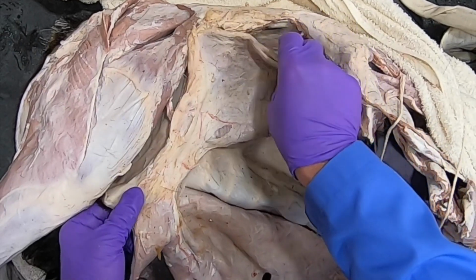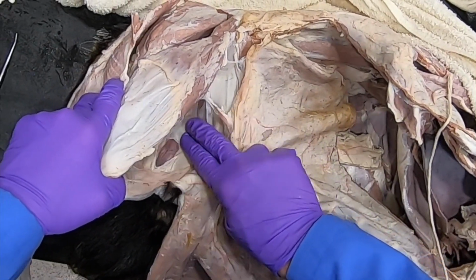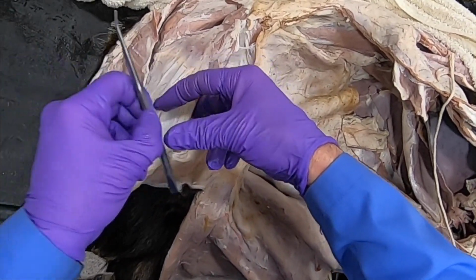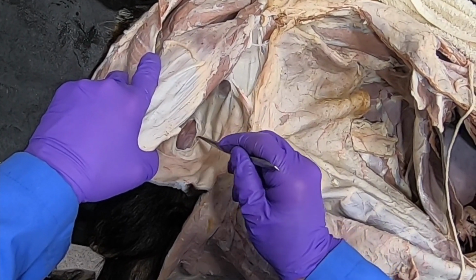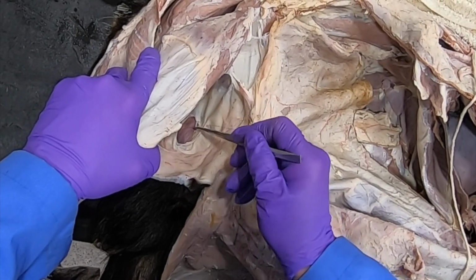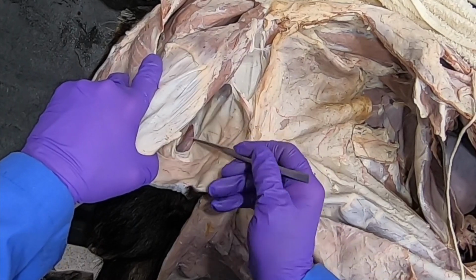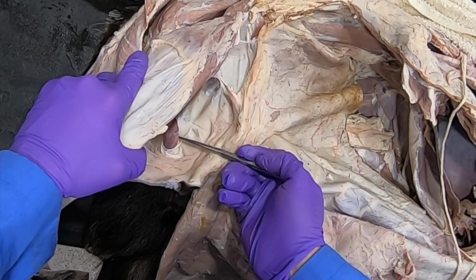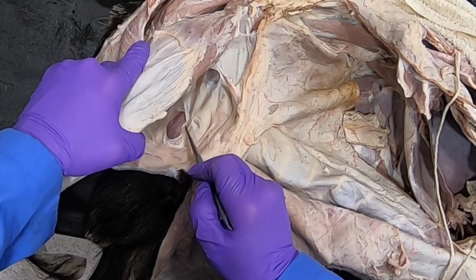Okay, so this is our external abdominal oblique muscle. And we reflect that down. We follow its aponeurosis up under here, and we can see that we have a slit in the aponeurosis right here, and coming through that is the cremaster muscle and the spermatic cord. Okay, and the goat, they have a very big cremaster muscle. Okay, so this here is the superficial inguinal ring.